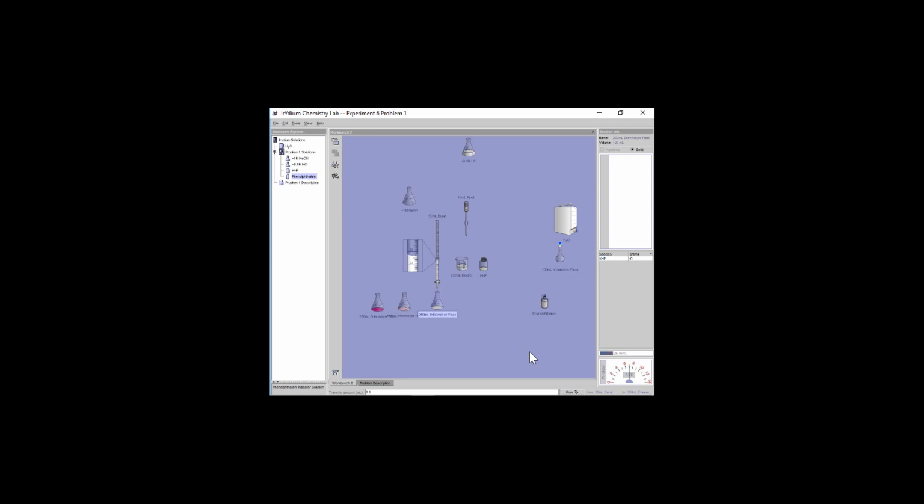And maybe I want to go even more precise than this. Maybe I only want to drop in 0.05. It's like a partial droplet here. I want to get as fine-tuned as I can. When does this pink color finally first appear?